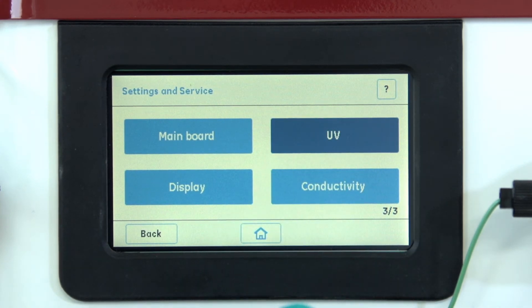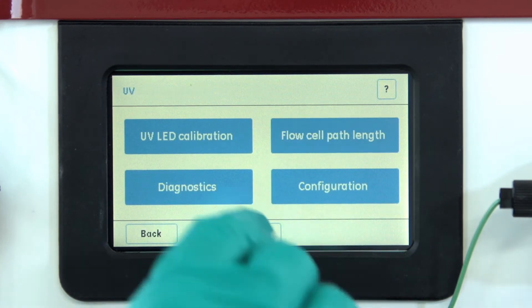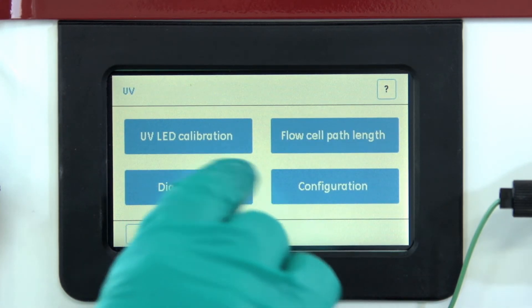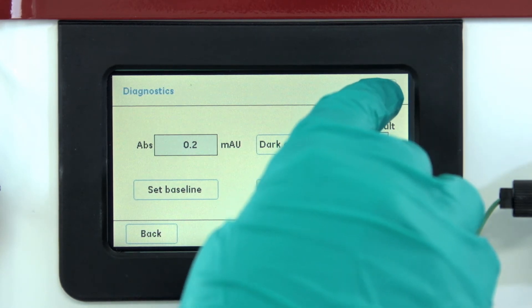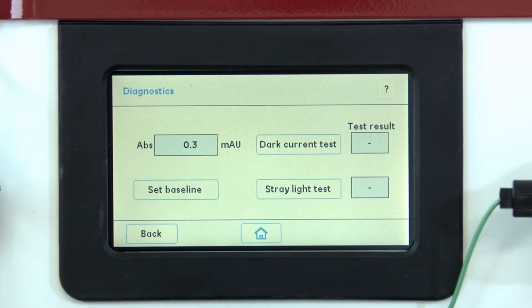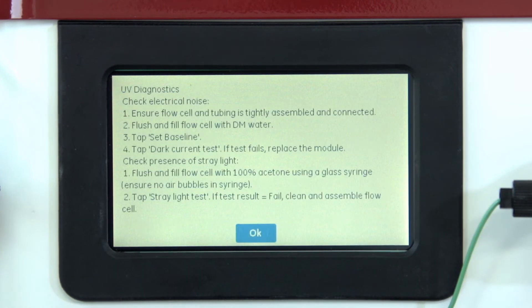ECTA-START has a UV monitor to track your protein through purification. The monitor can be calibrated using a built-in template.